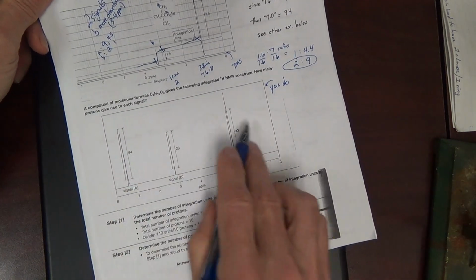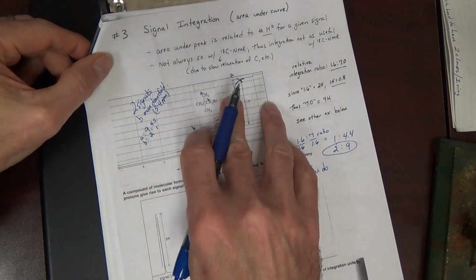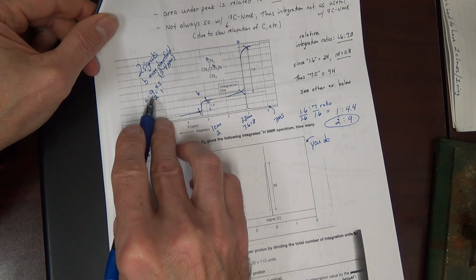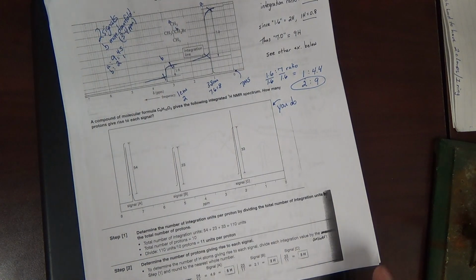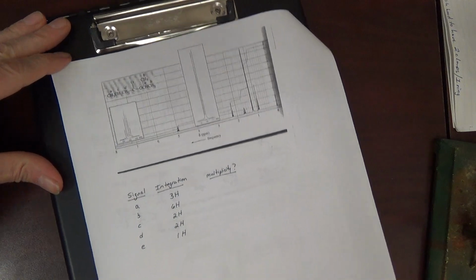But keep in mind, though, we don't have a compound here. All right, we're starting with the integrals. Up here, I started with the compound, and I established the 9:2 ratio just from the compound. All right? We need to be able to work just from the spectrum, and that's what we're doing down here. We're making some progress here.